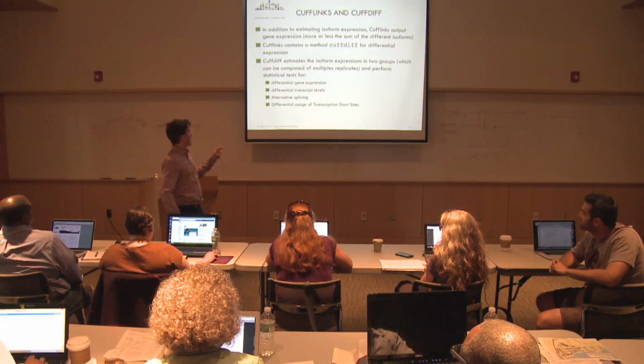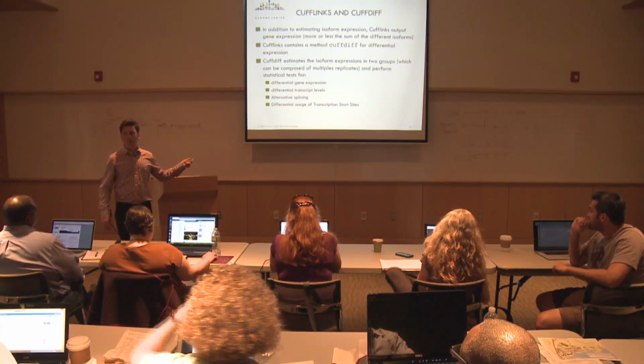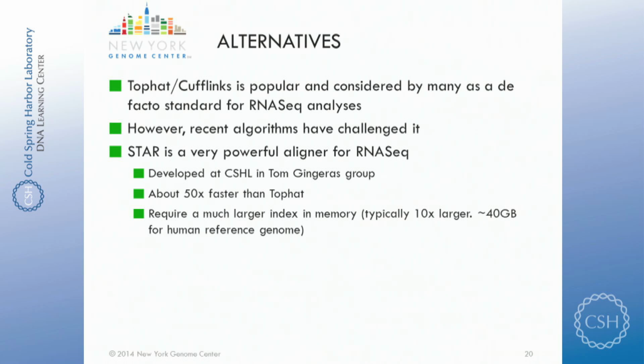So my next slides are different alternatives to this approach, okay? So website, but otherwise it's possible to give a FASTA file and make an index out of that. So you can run any of your organism, as long as you have a reference sequence in FASTA format, you can create an index. What I'm saying is that star index will be much bigger than the TOPHAT index.